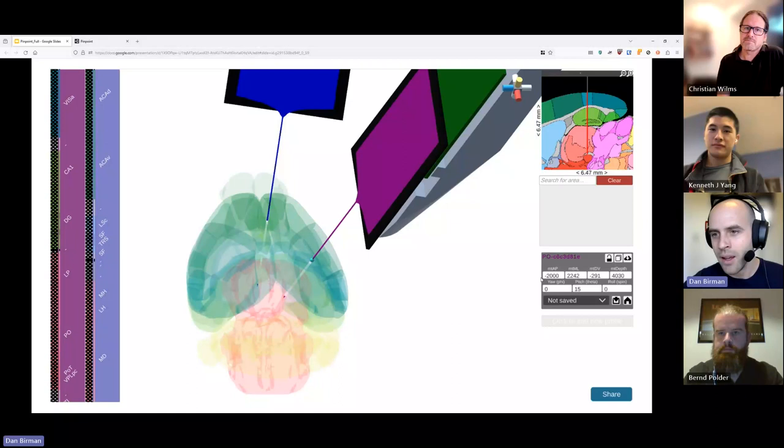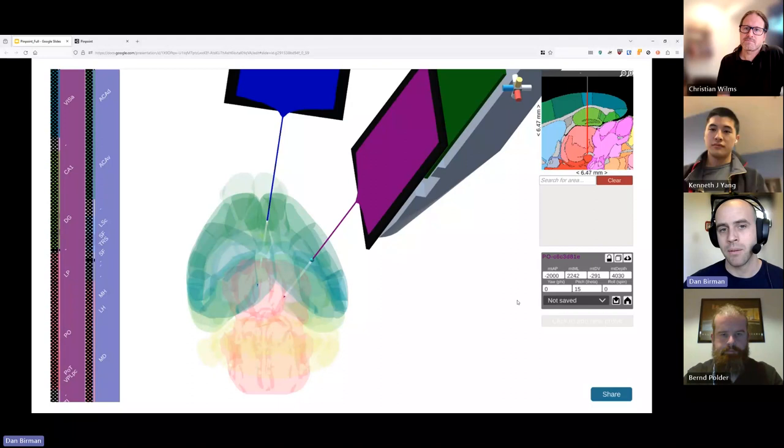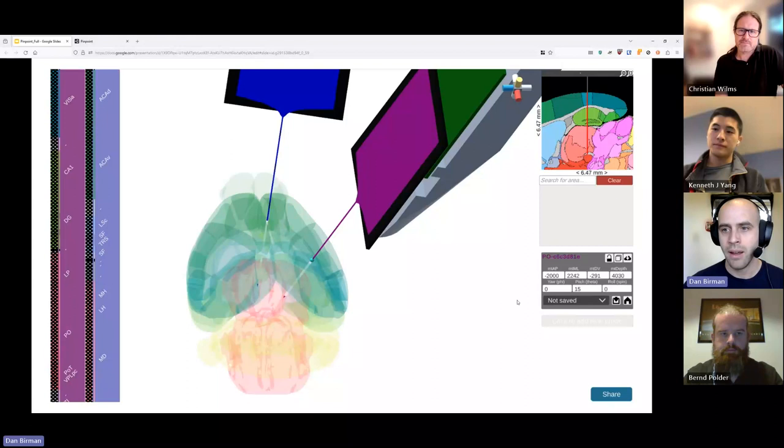Maybe the most important thing is the probe coordinates panel on the right side. It indicates the entry coordinate and the depth relative to some reference coordinate. We usually use Bregma by default for the mouse. These are the coordinates that you actually have to take with you to go and do your surgery and insert the probe in the brain.